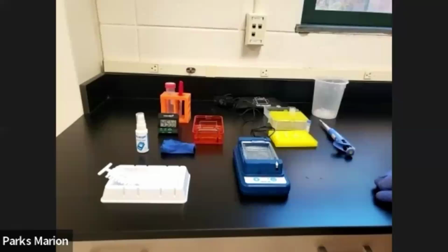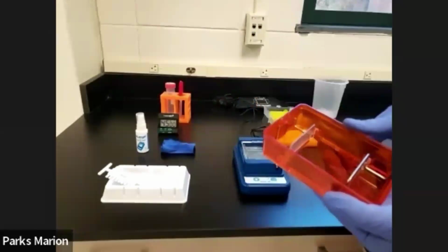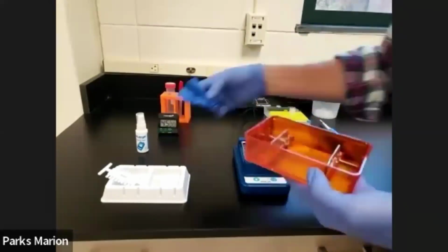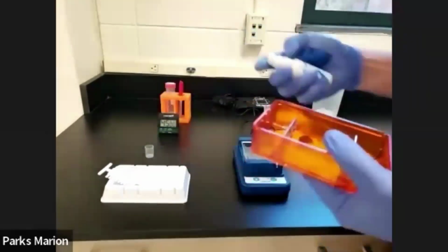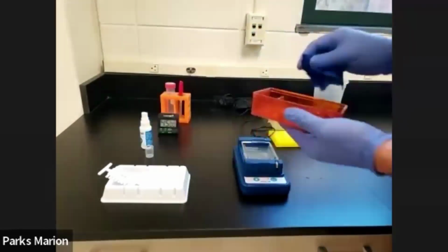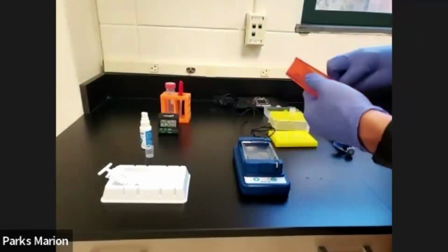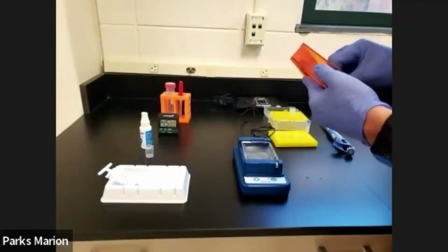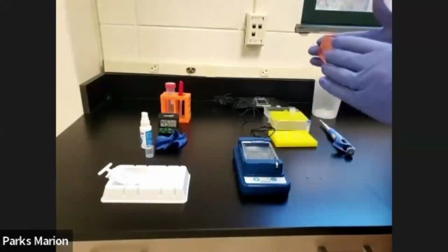Now, with your wells filled, you're almost ready to run your gel. Before you place the cover on top of your machine, you'll want to make sure that you have added this clear view spray to prevent fogging. Give it a spray, rub, so there's no streaks. Then your cover is ready.